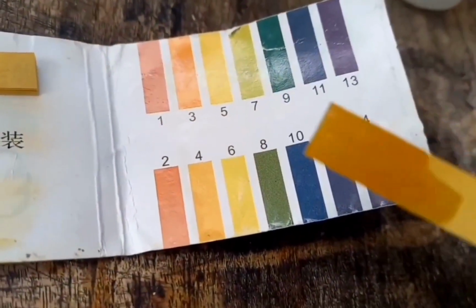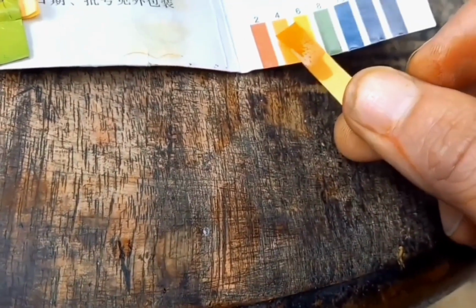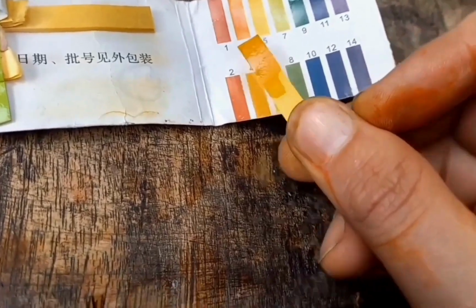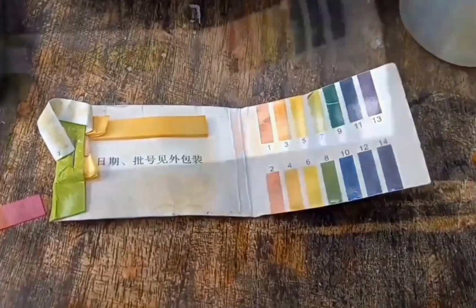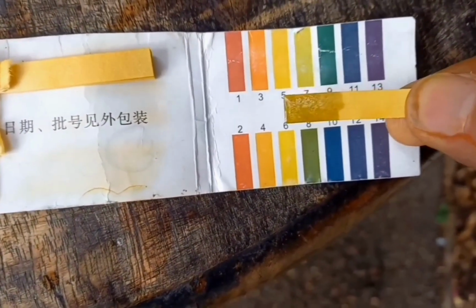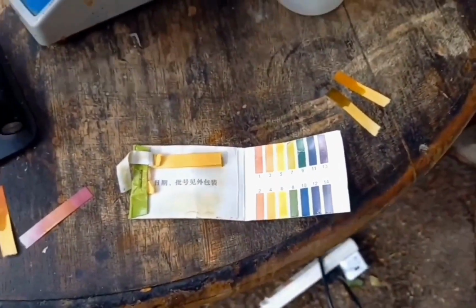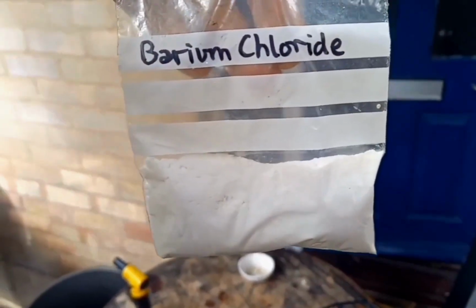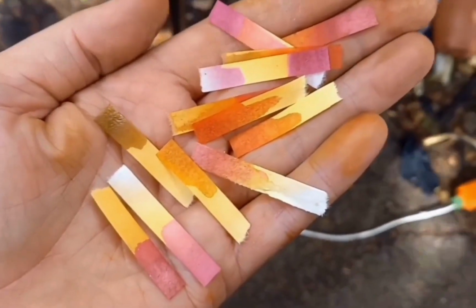Now, it is looking a little bit acidic still. It's like 4, I think. It's not quite 3, so, well, it's getting darker as I hold it. Okay, a little bit more. Now, it is alkaline, slightly on the green side. And this is good. Next I can add barium chloride, which should precipitate out barium selenate. So that was fun.